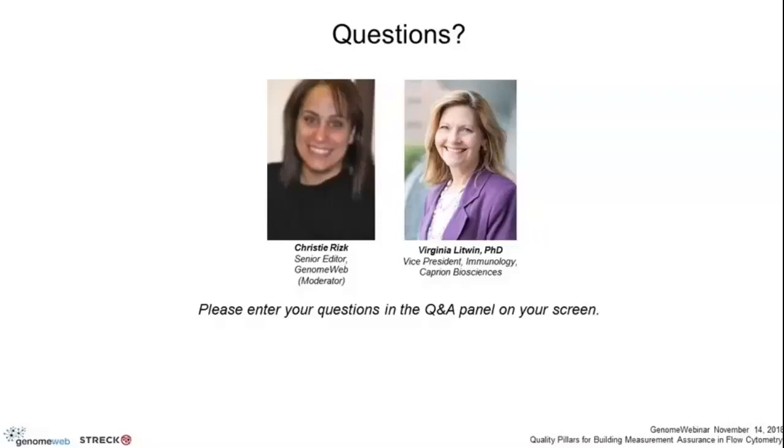But I've found that mostly you'll find the population and you can monitor it in your reference material, and that does add value, especially if you've got a traditional gating algorithm. Very few cases have I seen where I get such bad CVs that I can't monitor that population with that QC material. But what I'll do then is make sure that I have a population, say with PD1, where I do have PD1 reasonably expressed, and I can monitor that population.